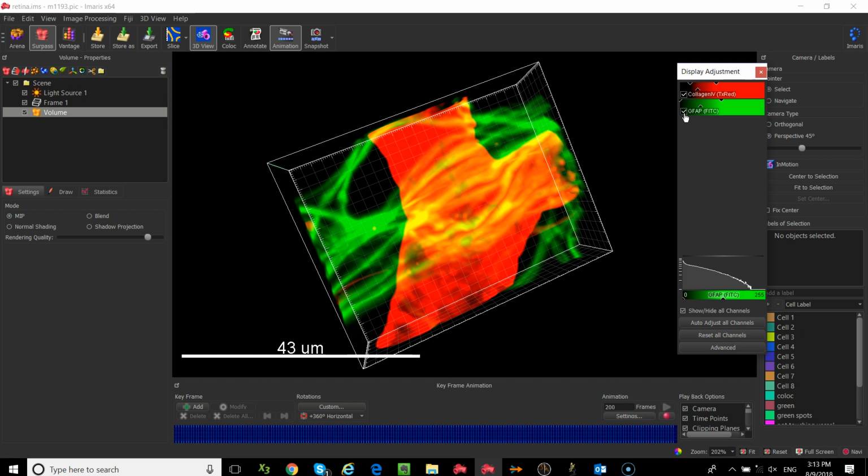The next thing that I want to go over with you, and I'm going to make my scale bar a little smaller. Sorry, it's kind of big. I want to go through a surface reconstruction, okay? So we talked about this morning. We talked about different rendering modes. We talked about modeling. The first model I want to show you is a surface model.